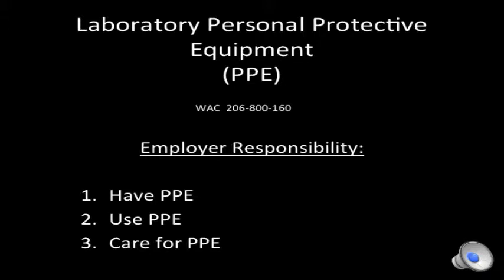This safety training module has been designed to educate laboratory supervisors and their staff at Lower Columbia College on the use of personal protective equipment, commonly referred to as PPE. According to Washington State Administrative Code, LCC is responsible for ensuring you have appropriate PPE, are trained on how to use your PPE, and know how to care for your PPE.